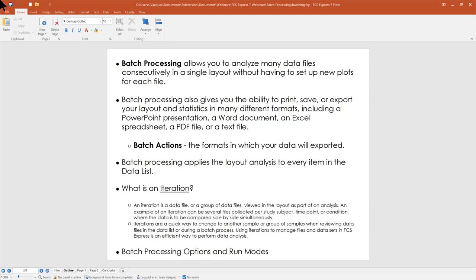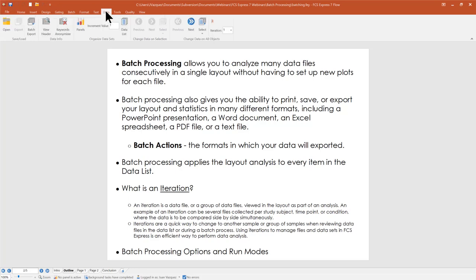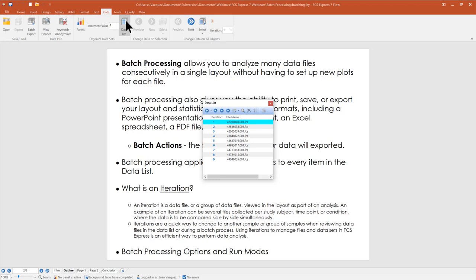Batch processing in FCS Express applies the layout analysis to every item in your data list. The data list is a window in the FCS Express UI where you add data to your template. As data is played through this template, you'll see the plots automatically refresh with all the different data files one by one. FCS Express then exports this data in whatever formats — whatever batch actions — we've set up as part of the template.